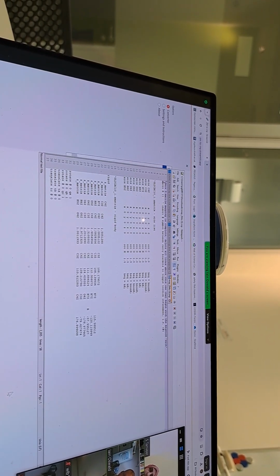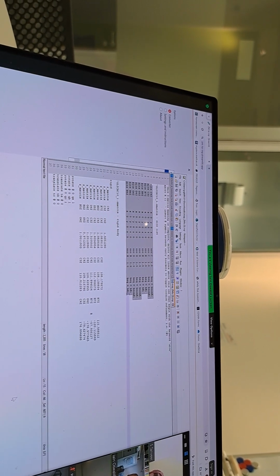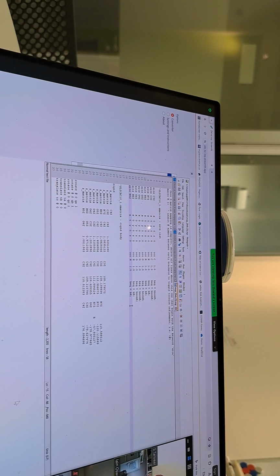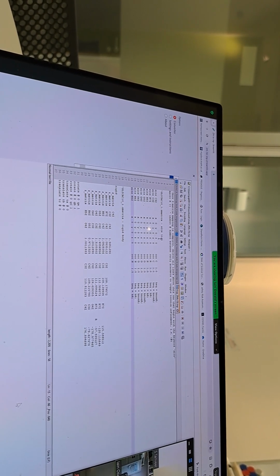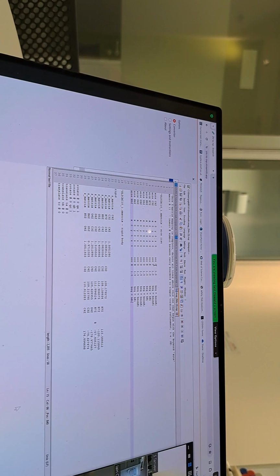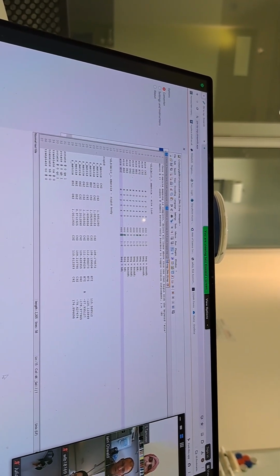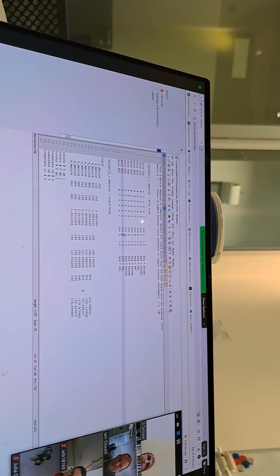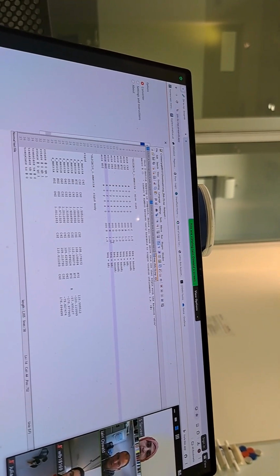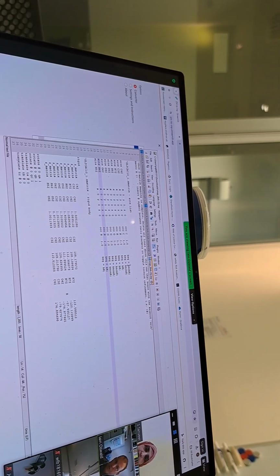So you can see here that you've got your positions in terms of your basis vectors, your a, b, c. So that'll be your X coordinate, Y coordinate, and Z coordinate. You've got your occupancy of whatever atom it might be. If, for example, you're doing neutron, then you might need to change these H's to D's. You've got an occupancy saying it's 1, so that all the atoms are there 100% of the time. And then you've got this thermal parameter over here.